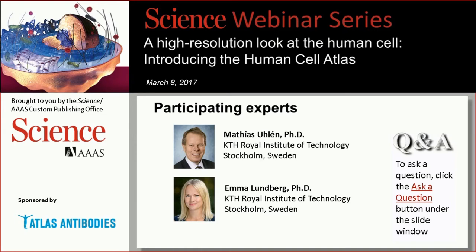These are not that many antibodies, and we still want to show them because we think that they might be correct, but we also want to show the researcher that these should probably be validated, and we want help to get them validated by the community or by more work. But in most cases, the antibodies have been quality controlled using our standard procedures, and they are there for everyone to see in the antibody validation pages.